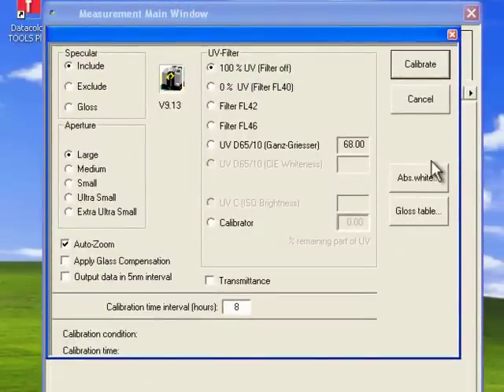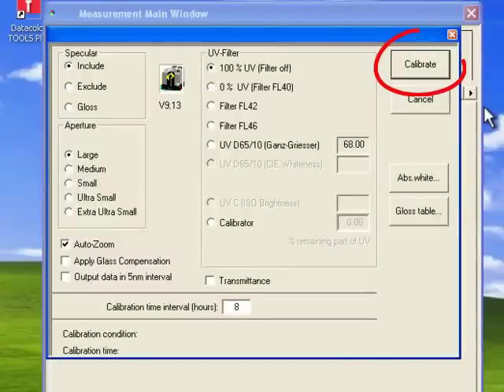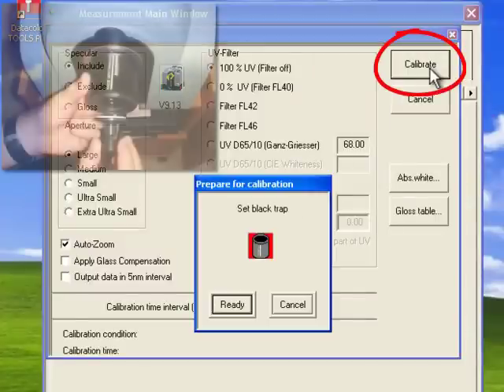The system automatically opens the calibration screen. Select the desired calibration options for your instrument and click Calibrate.